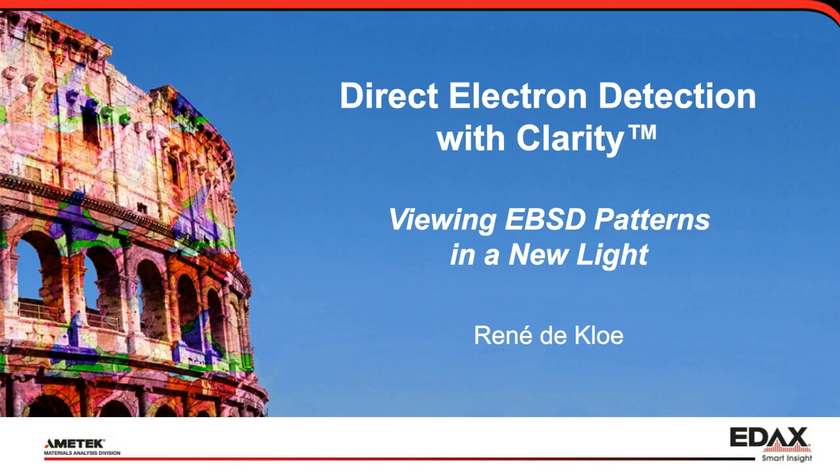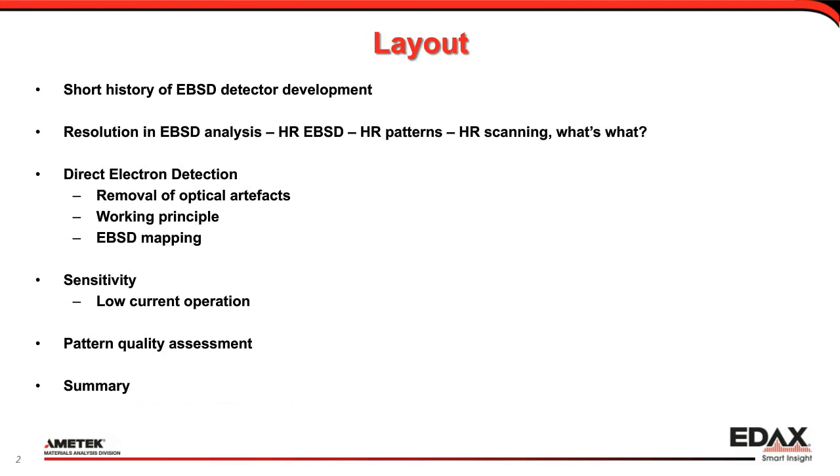Let's get started. So the layout of today's webinar: I'll talk briefly about a short history of EBSD detector development, because if I say looking at EBSD patterns in a new light, let's have a little bit of perspective on what the old light used to be. Then a few words on resolution in EBSD analysis. What do we mean by it?